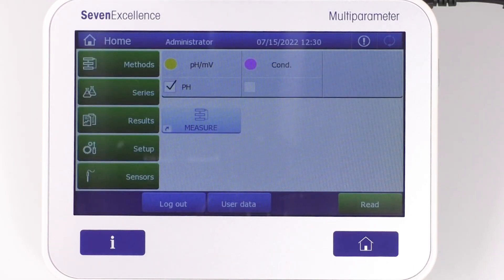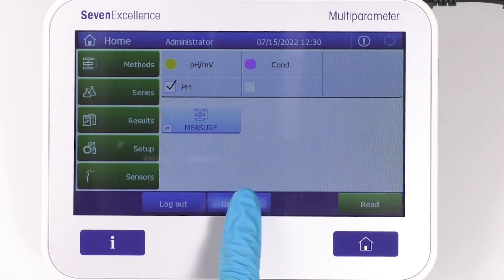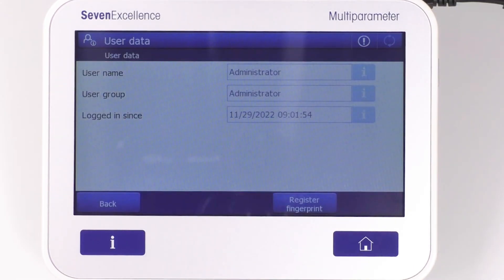From the home screen, the user data can be accessed. This menu displays the user's name, group, and time of login.